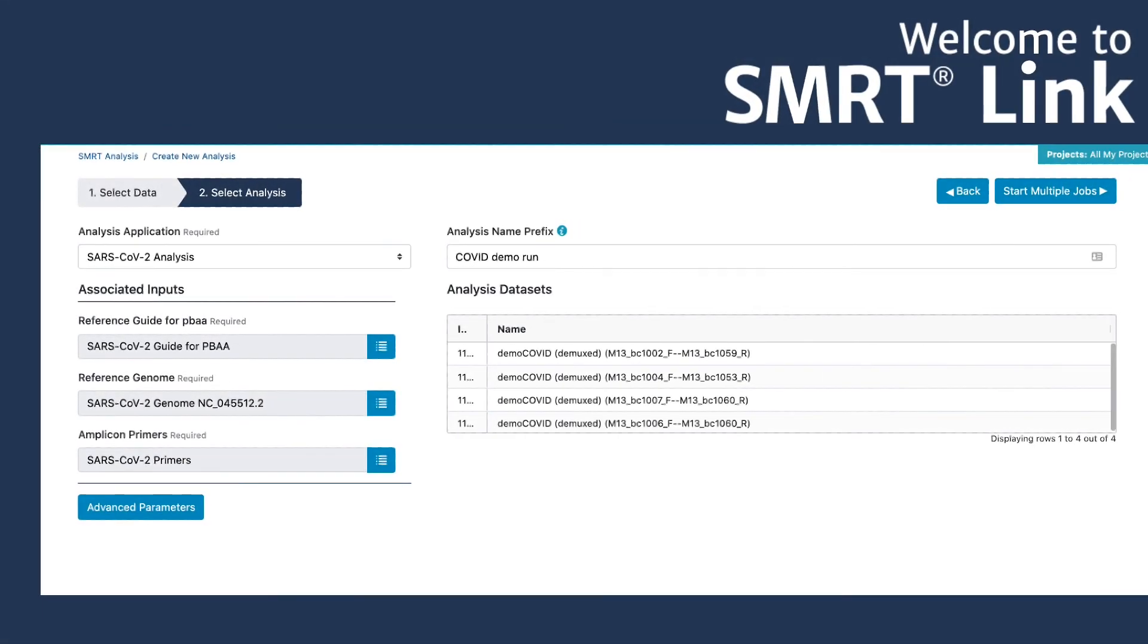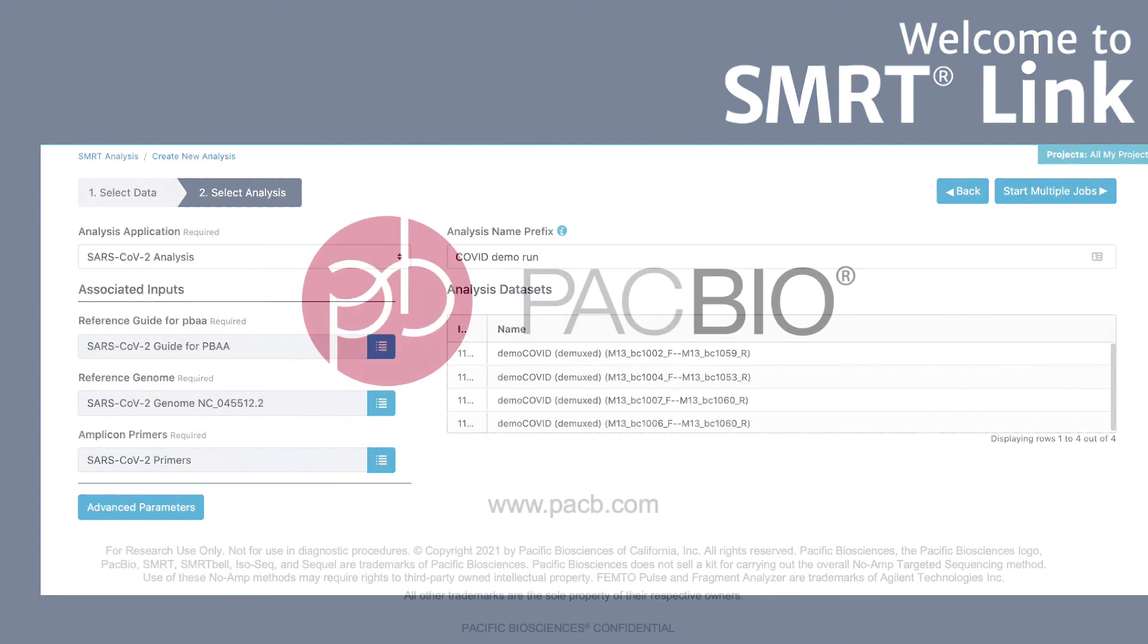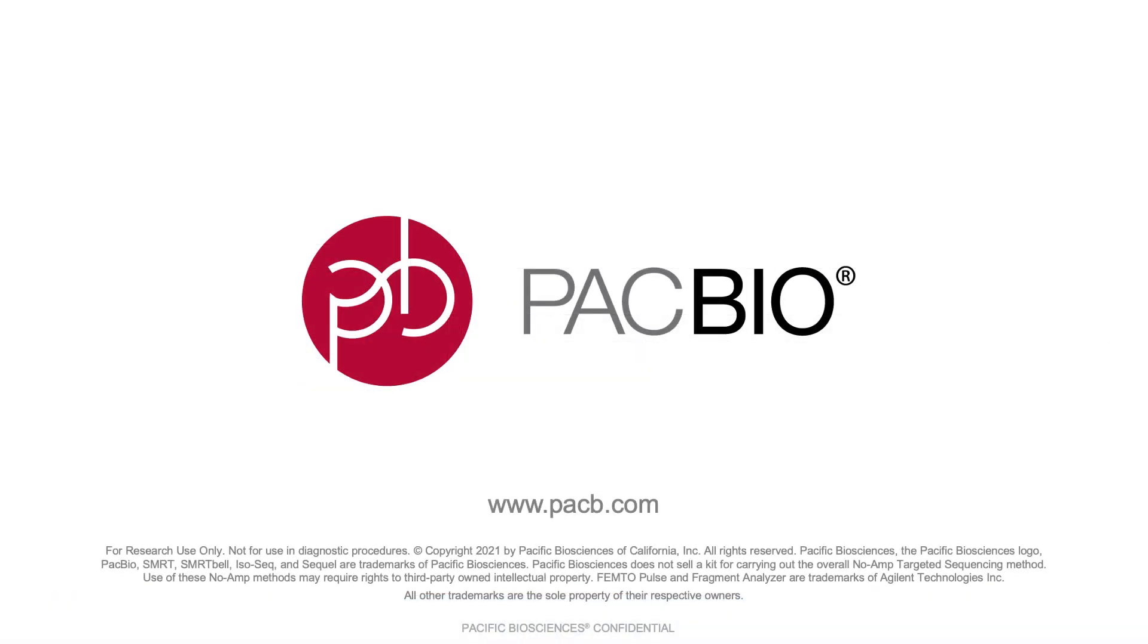The SARS-CoV-2 workflow in SmartLink provides you with an easy solution to analyze your viral surveillance samples with all the benefits of high-quality long-read data.